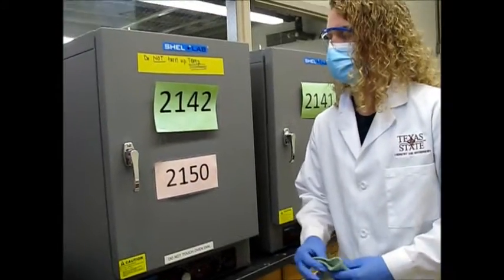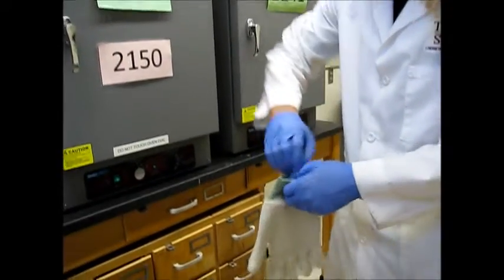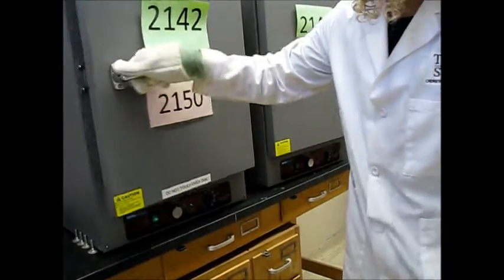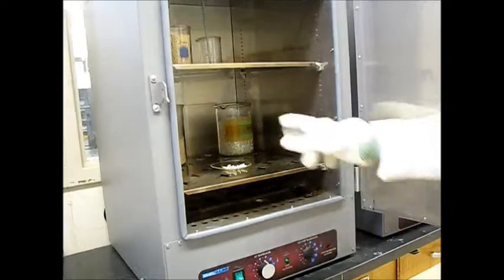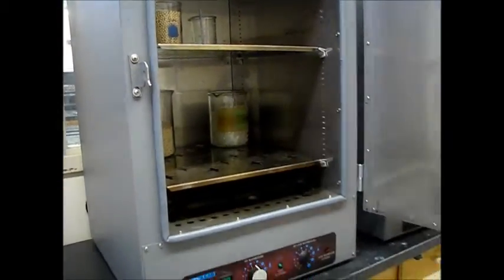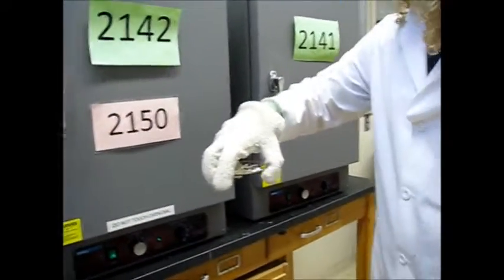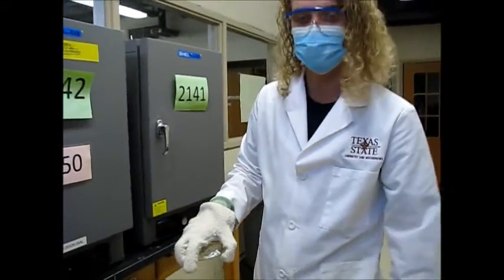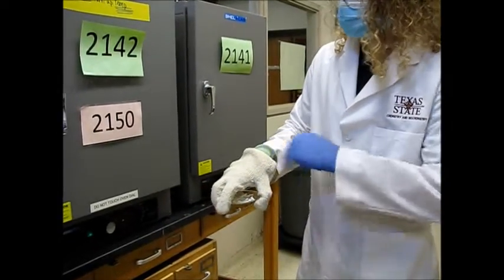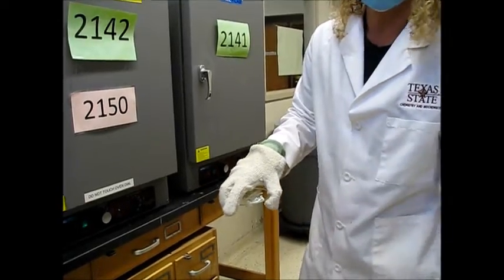So it's been about 10 or 15 minutes in the oven now. We need to make sure we grab our oven mitt. This is part of our PPE to ensure that we don't burn ourselves on the hot glass. So we're going to go ahead and put this on. So our product here looks nice and dried out. Go ahead and grab it like this. Close the oven. Before we get a mass for this, we need to wait for the watch glass to cool down, or else we might get an inaccurate reading for the mass. So we're going to set this down outside and just let it cool down, and we'll record the mass once it's cooled down.